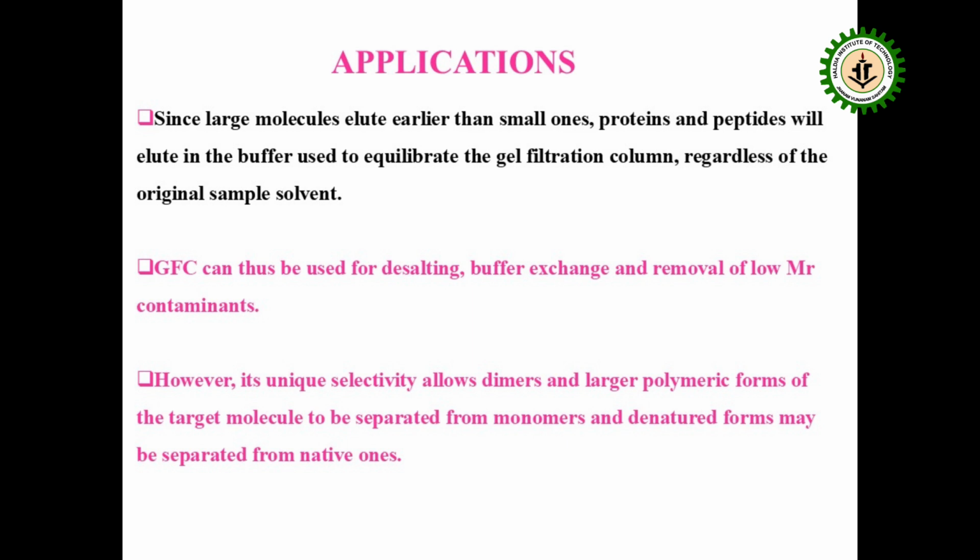GFC can be used for desalting, buffer exchange, or equilibration of particular molecules or species, and removal of low molecular weight contaminants. However, its unique selectivity allows dimers and larger polymeric forms of the target molecules to be separated from monomers, and denatured forms may be separated from native ones.